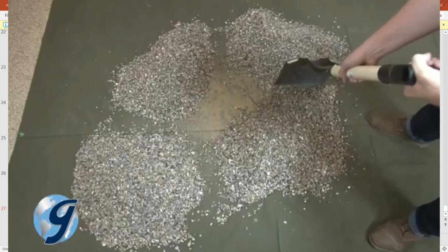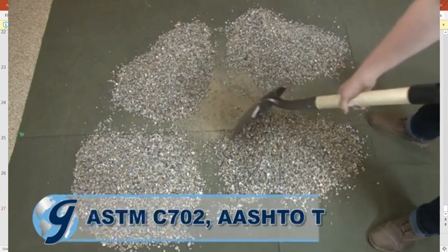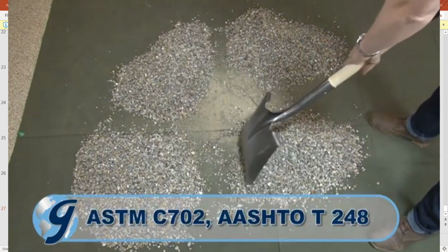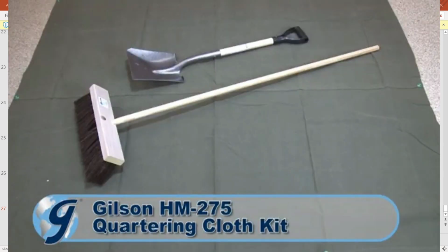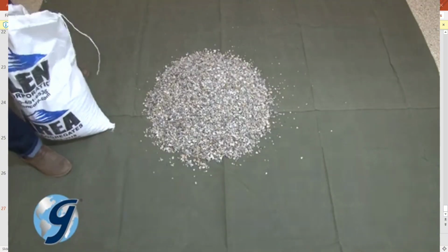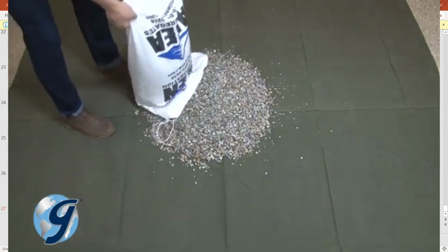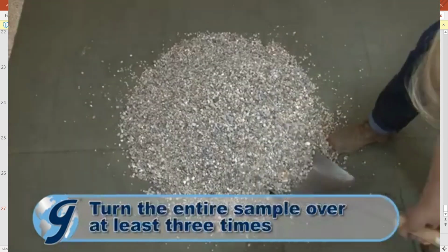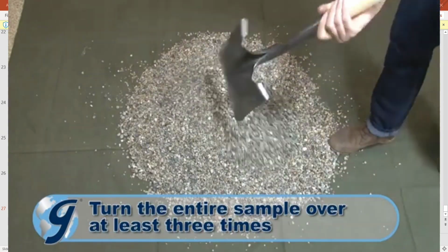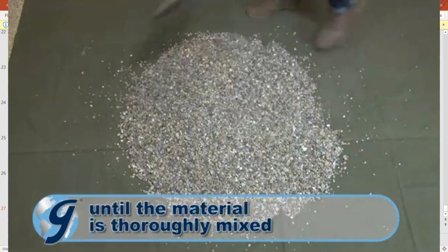For this demonstration, we will be dividing a bulk sample in accordance with ASTM C702 and AASHTO T248 standards, using the Gilson HM275 quartering cloth kit. To divide a sample, you first place the sample on a spread-out canvas blanket. Now mix the sample by turning the entire sample over 3 times until the sample is thoroughly mixed.